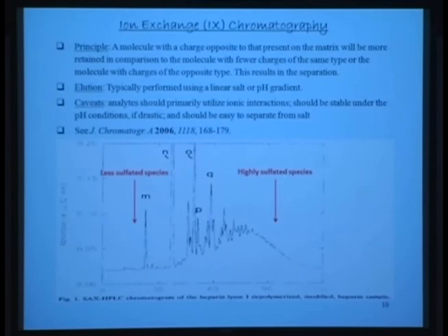So in here you can see thousands of species present. Okay, and that's the level of complexity. So when somebody says that I want this particular hexasaccharide or octasaccharide to be prepared from heparin, you have to really isolate it from here, and therein lies the challenge. Okay, it's not really an easy thing to do.